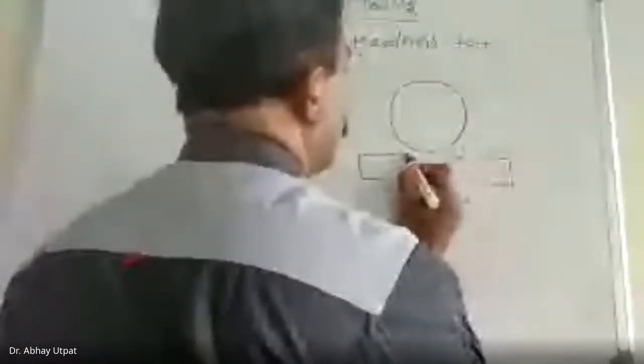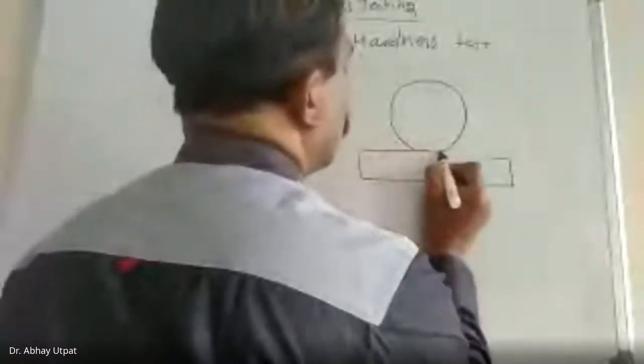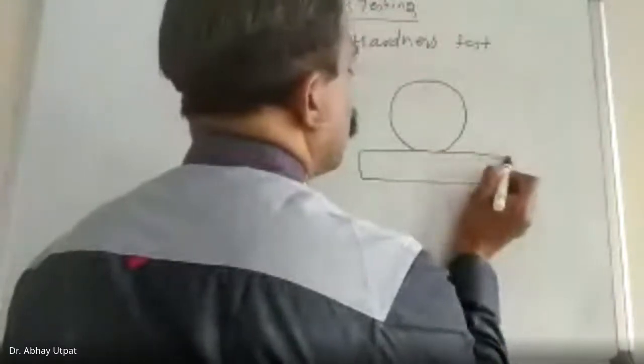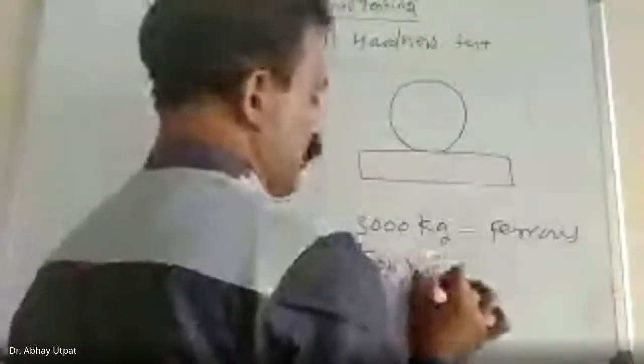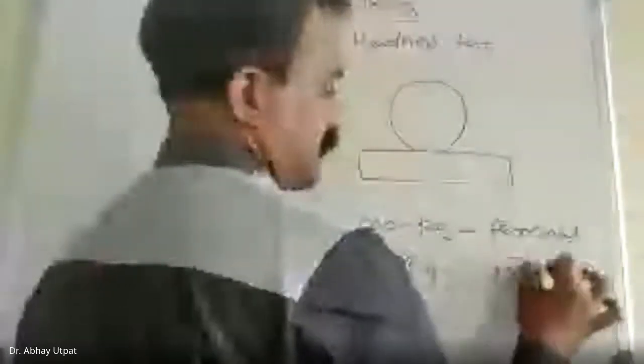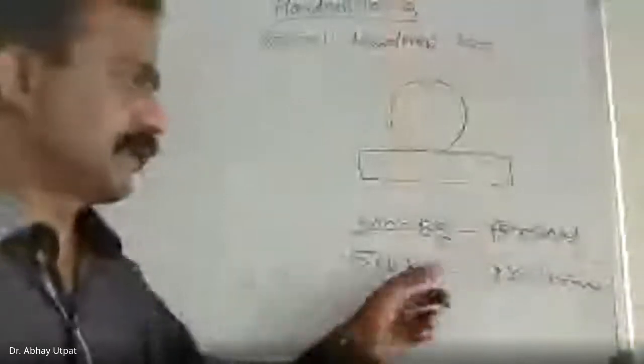Standard test consists of application of 3000 kg for ferrous and 500 kg load for non-ferrous material.